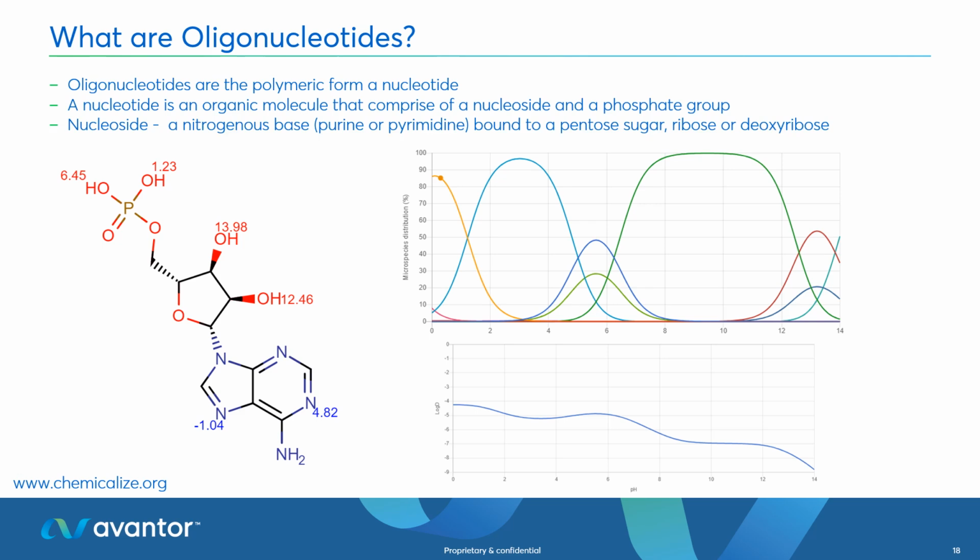What we also see is that as we increase the pH, the log D becomes more and more negative. And the reason for this is because as we change the pH, we're activating more of those charged states. In particular, by increasing the pH, we are removing protons from the chemical system, and that means that we'll end up with more acidic groups becoming charged, which is exactly what we see.